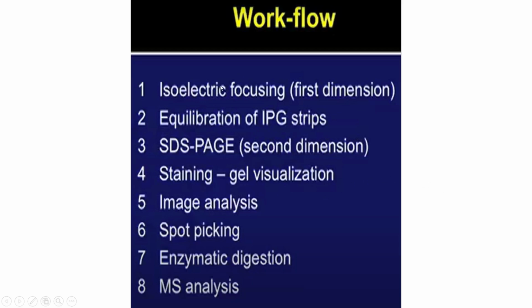Initially, the first step is obviously the sample preparation, which we did in the week two lecture. Then there is isoelectric focusing, then equilibration of the IPG strip after running the isoelectric focusing so that it can be used for running the SDS-PAGE. Then you will do the second dimension, which is SDS-PAGE, and then you will visualize the gel. For visualizing the gel, you need to stain it first, and staining can be done in different ways. Once staining is done, you can visualize the gel, and then you will see different spots in the gel itself.